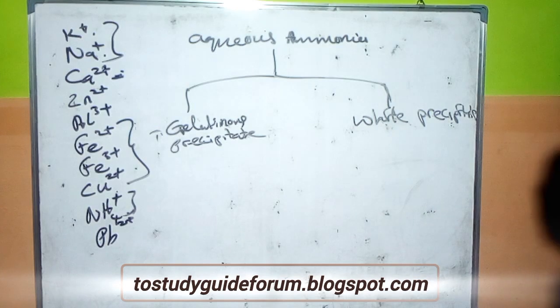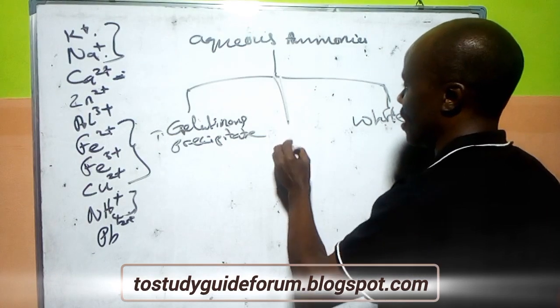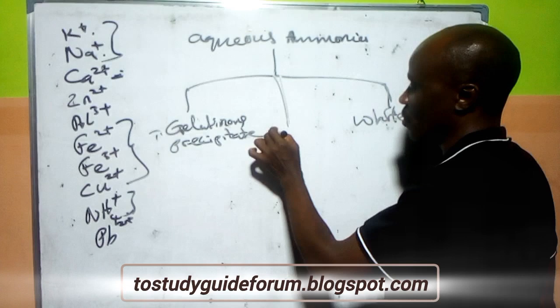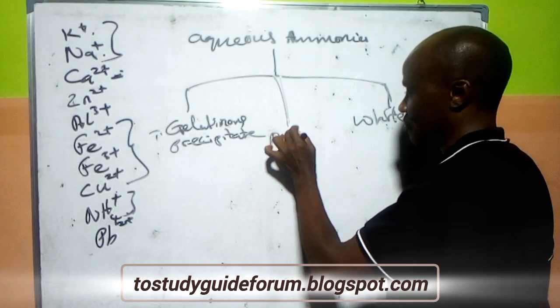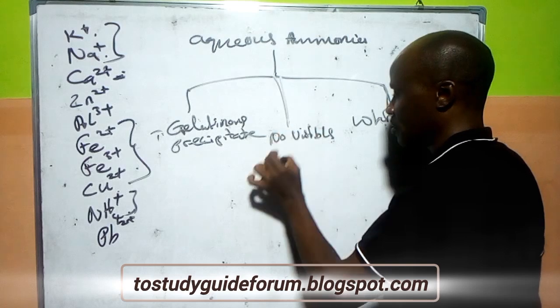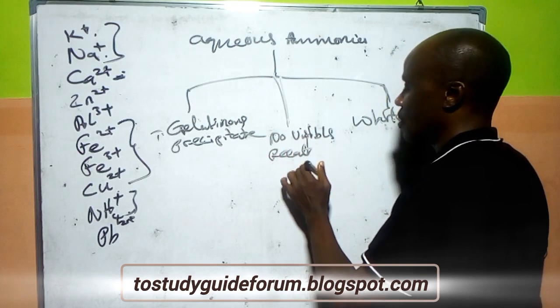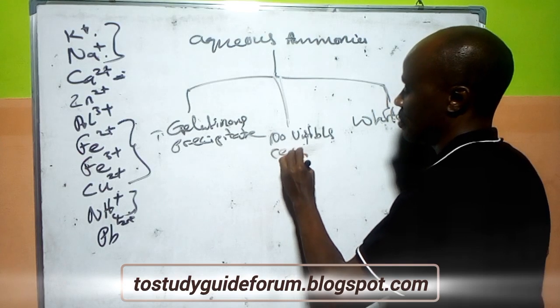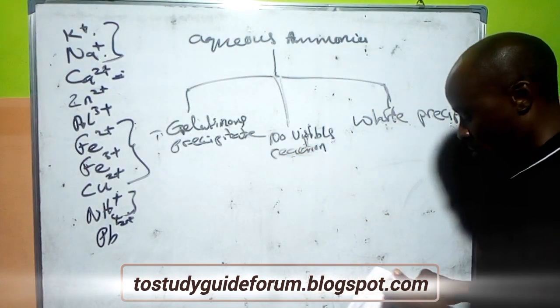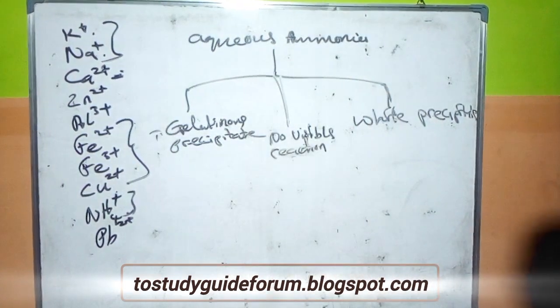And another unique thing about this is that we have one effect here which will give us no visible reaction. No visible reaction.